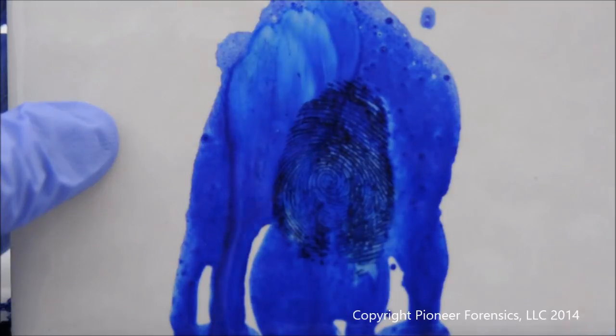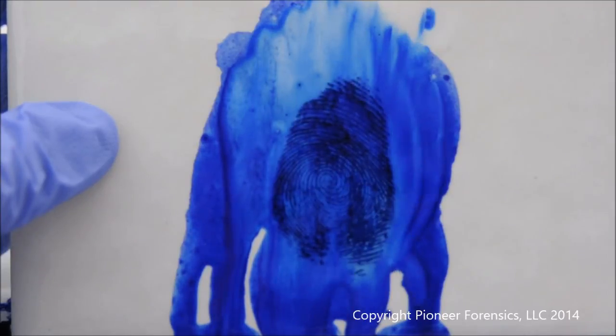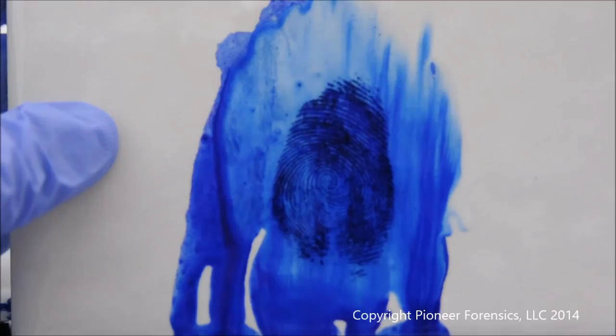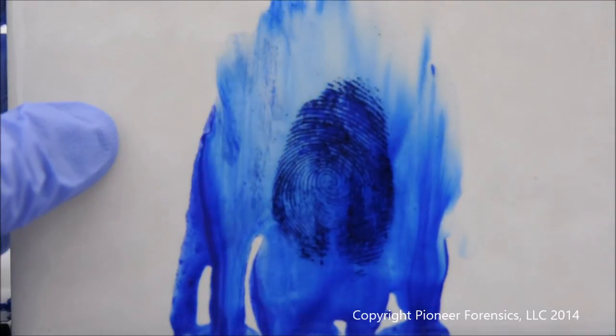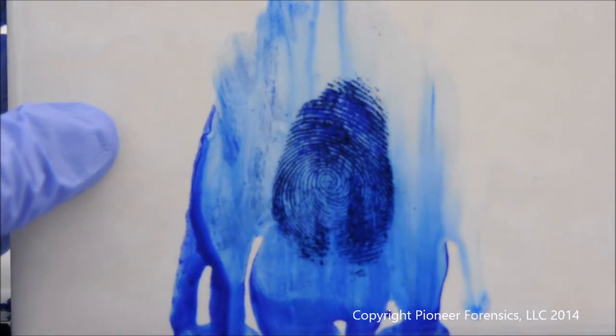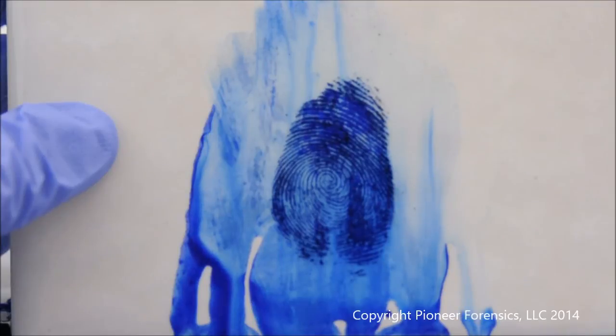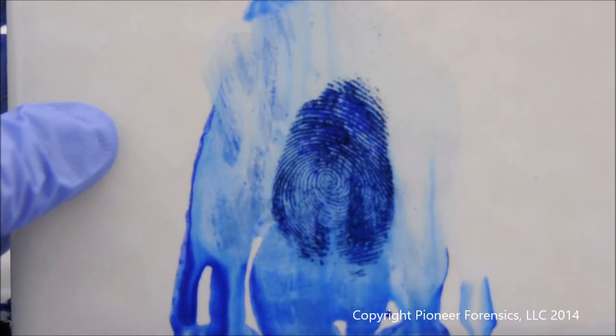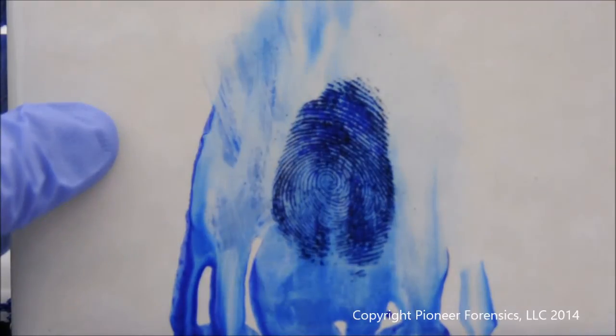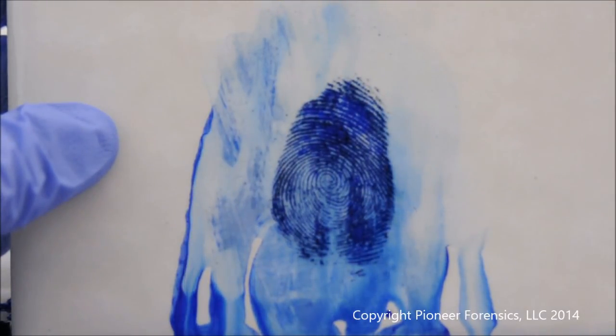So when we get to the rinsing part, even though a majority of the stain is completely rinsed away, where it's making contact with your bloody evidence, that will remain permanently stained. And if you look closely to the area that was latent before, there's almost better clarity and detail in the areas where it originally started as an invisible item of evidence.